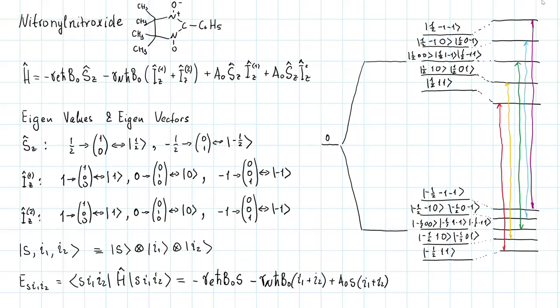Now we can put all these 5 lines together into one spectrum, as if it were measured in a frequency scan experiment. Here we have got 5 lines with 3 different intensities. The intensities of the first and the fifth lines are equal, and we will use their magnitude as a unit. The intensities of the second and the fourth lines are also equal, and their magnitude is equal to 2 in our case. The magnitude of the central line is equal to 3.